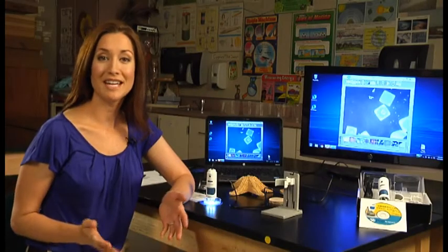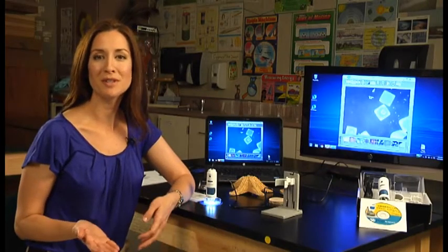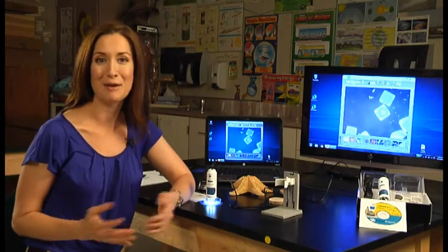The SmartScope is fun, it's easy to use, and most importantly, it gets students excited about learning.